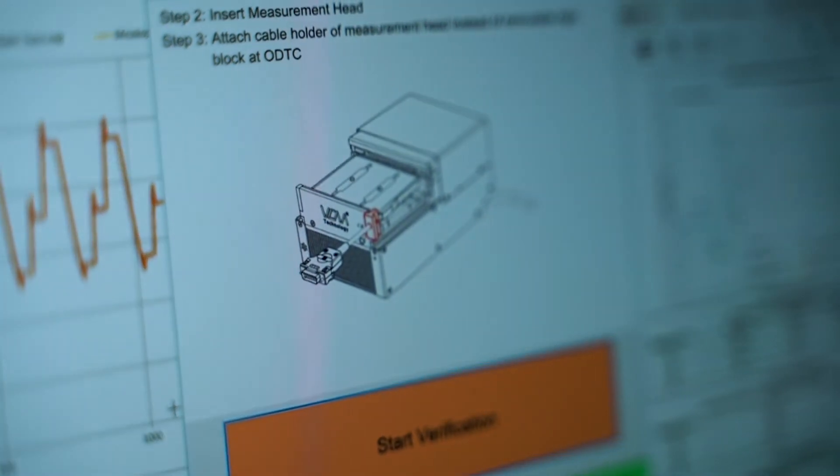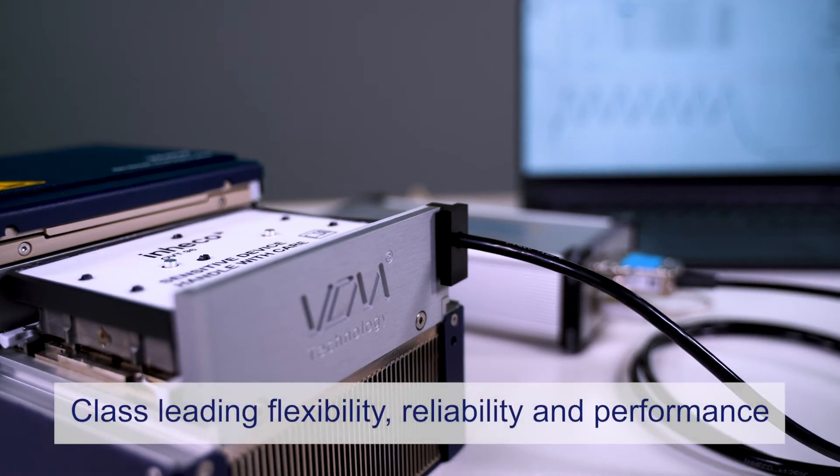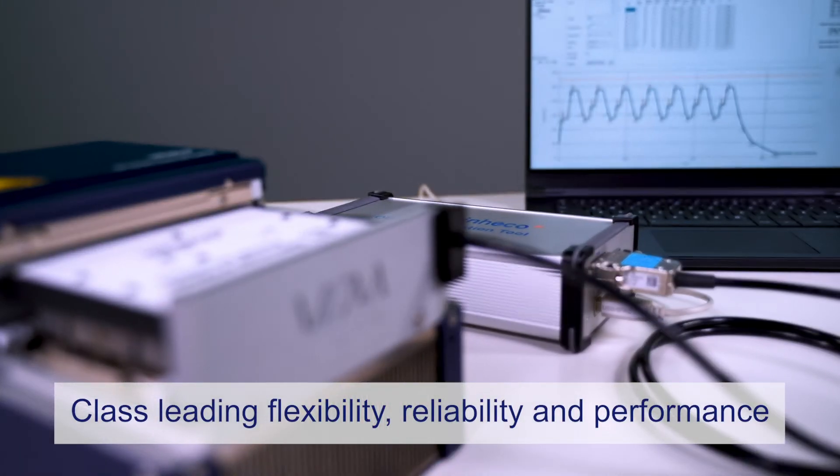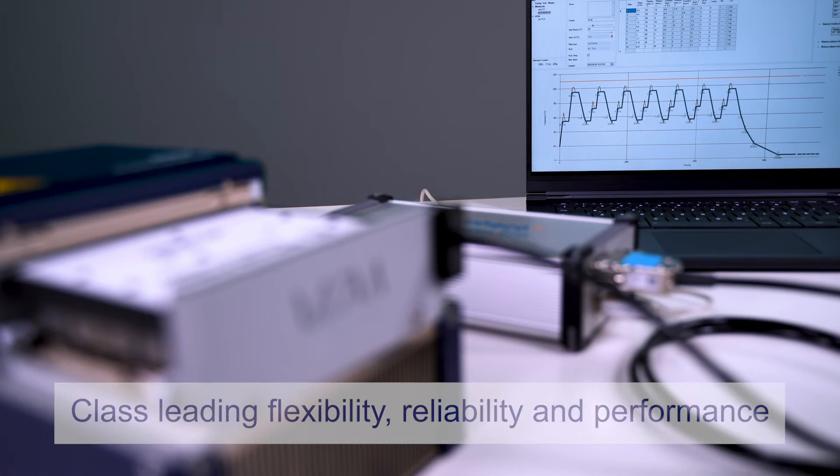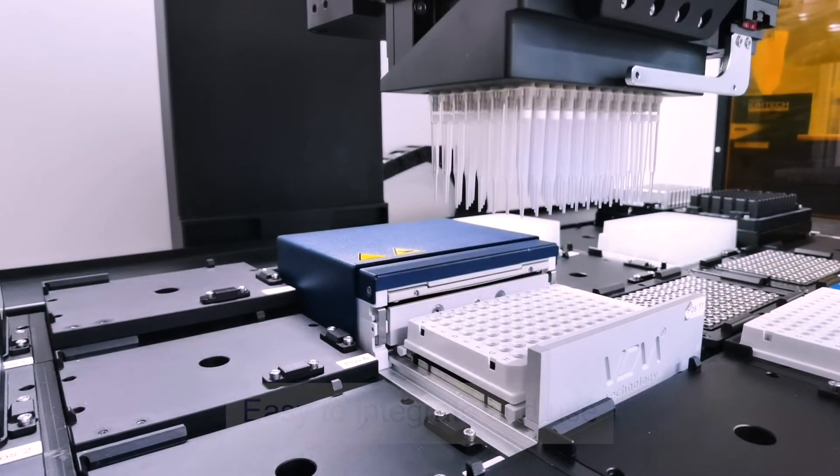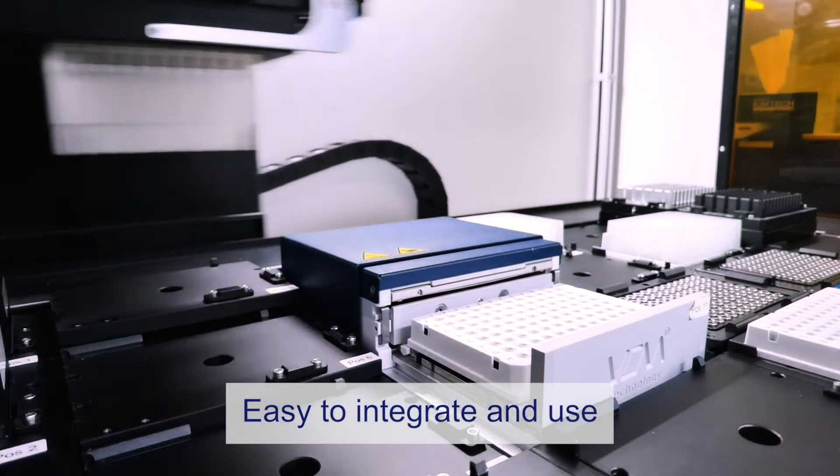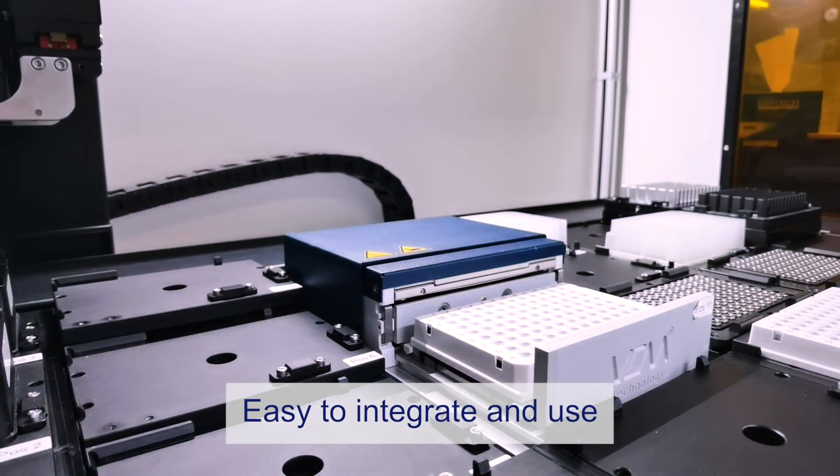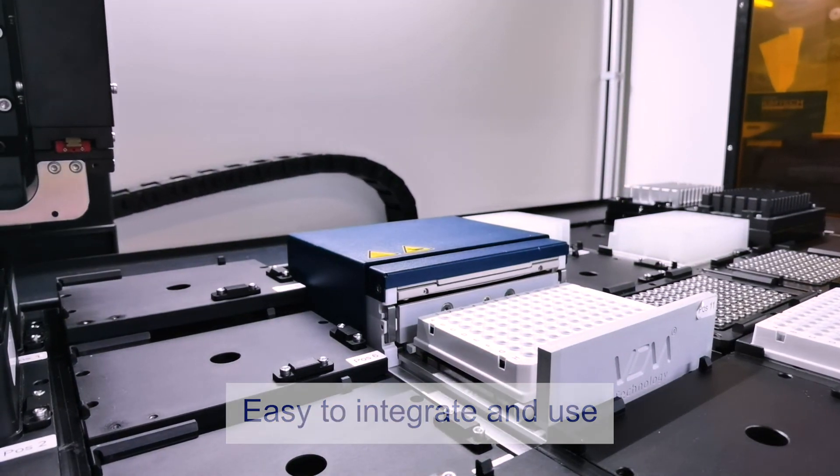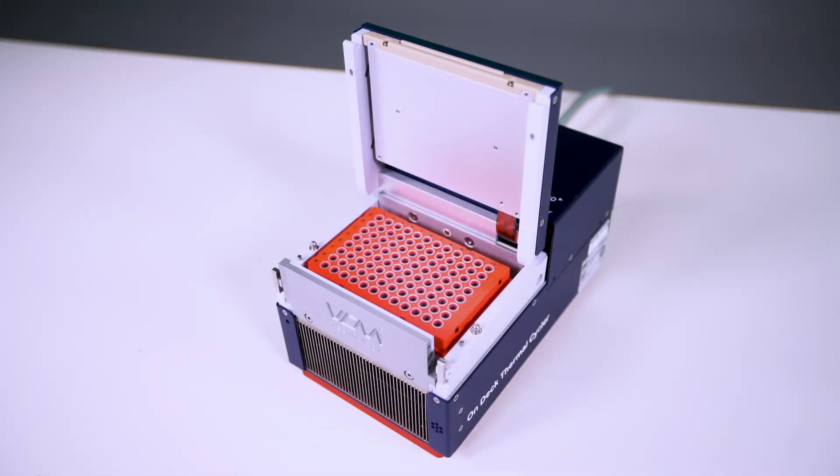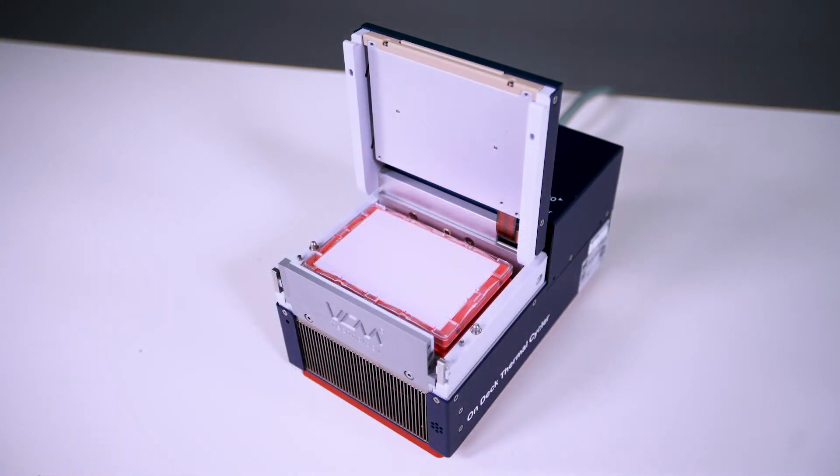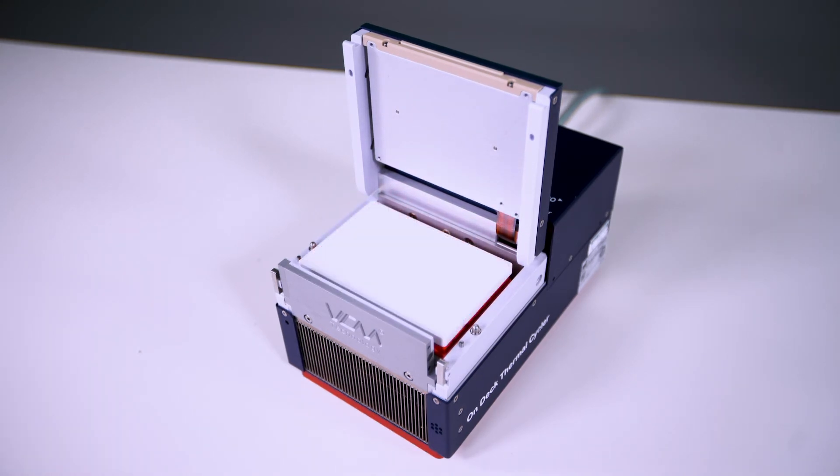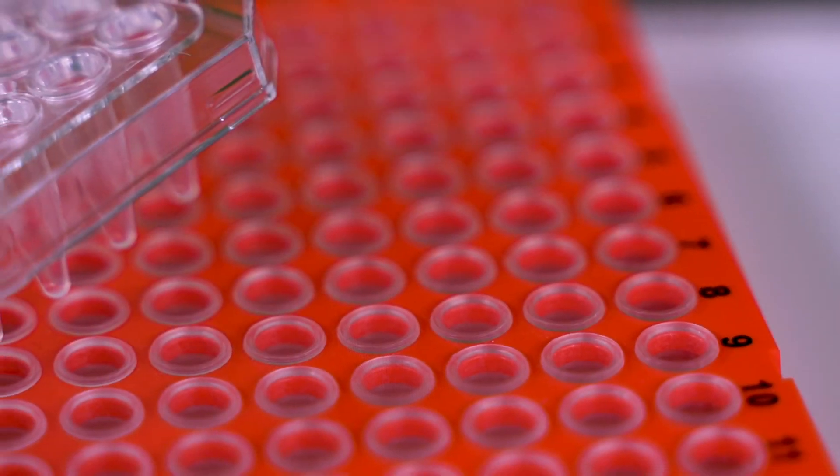The Inheko ODTC provides class-leading flexibility, reliability, and performance for lab automation applications. Our cycler has been designed to be easy to integrate and use, conforming to SLAS standards and compatible with all standard PCR plates and cover lids. Already integrated with decks from the world's leading manufacturers to enable rapid implementation into a wide variety of solutions and scenarios.